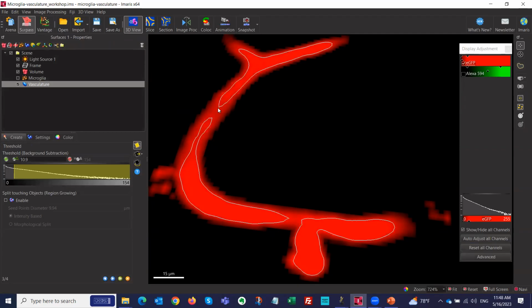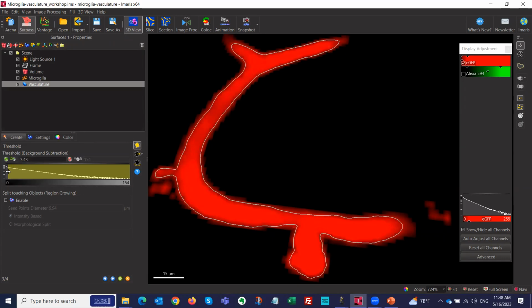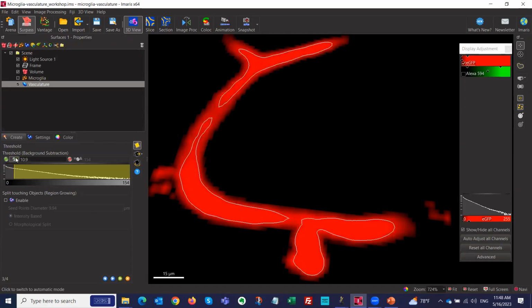We can see it's a little bit more of an under-segmentation here, so we lose more things. We can still go up and look pretty good, but we still include the human bias here. So this is a great example, typically they like to show, where the machine learning gives you a lot of flexibility and creates a much better result in this case.